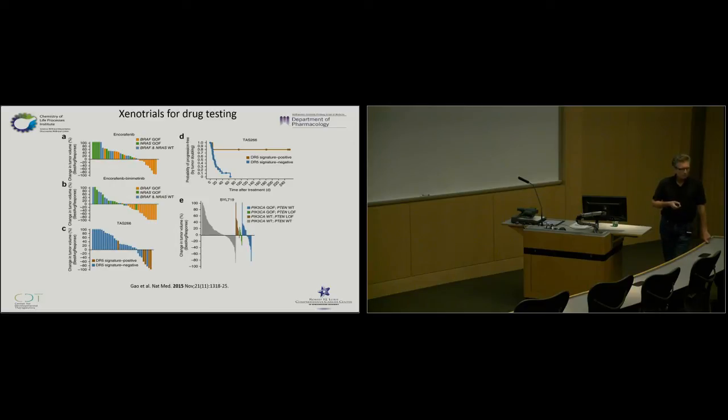Okay, so this notion of predictive value: you have this first tumor, you grow it up, and cut it up into chunks, as you said, 2 millimeter cubes. Transplant it, and you have enough mice to do the experiment. In your experience, how much variability do you see with mice in the drug response? So you start with one tumor from which you made 20 different mice, all supposed to be identical, and then you do a drug response study. How much variability do you see?